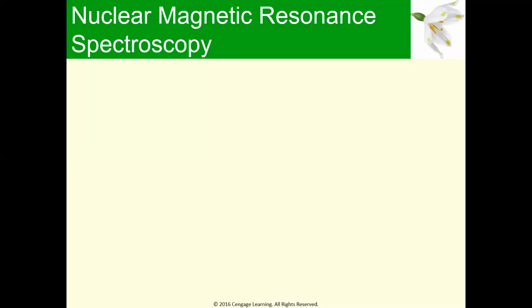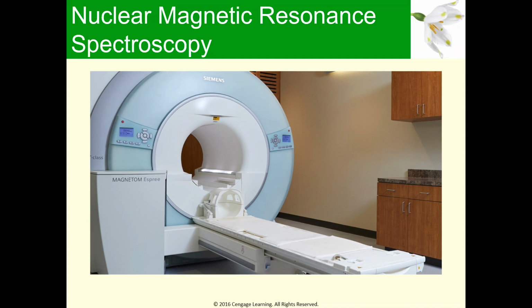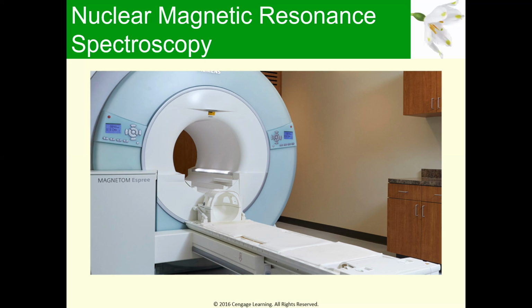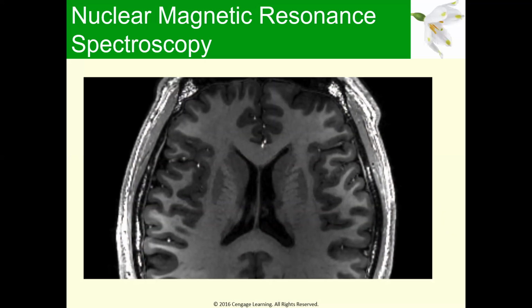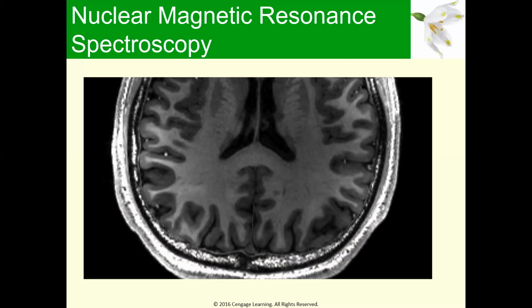So what we're going to study today is nuclear magnetic resonance spectroscopy. I know a lot of you have intentions of going into the medical field. You may be more familiar with something that utilizes this concept and this technology called MRI, magnetic resonance imaging. That essentially uses nuclear magnetic resonance spectroscopy, but then generates an image that can give you diagnostic information. So if you never take another organic chemistry course, you still have that to cling to for application purposes.